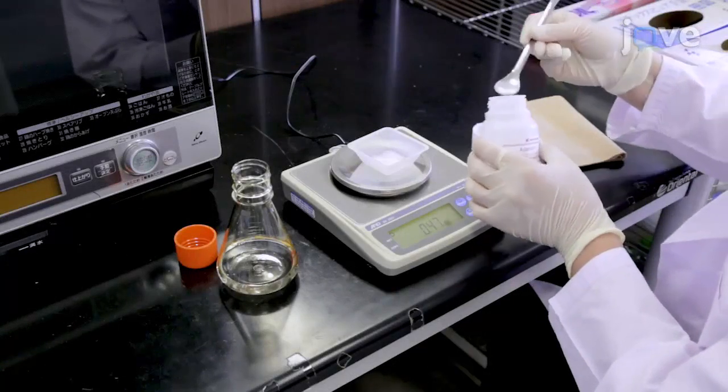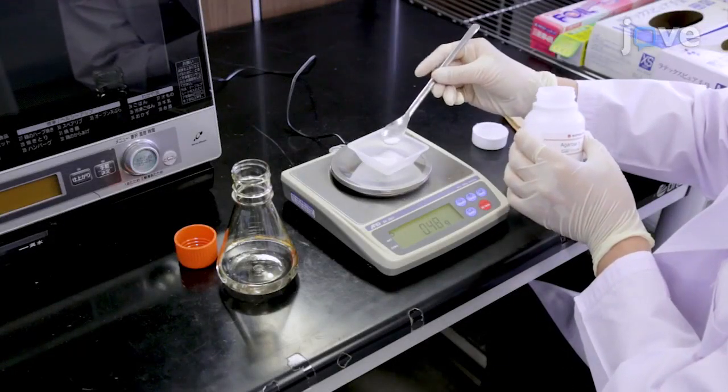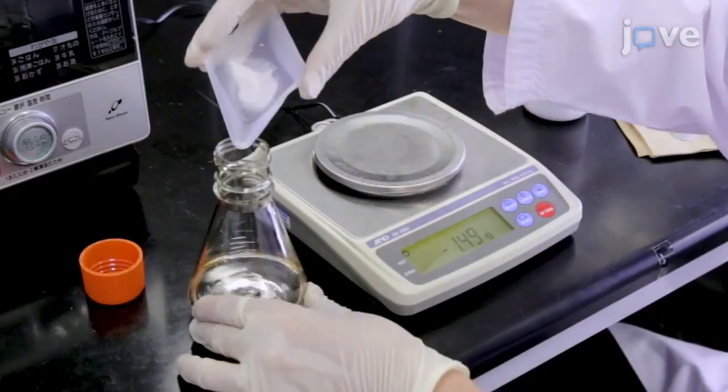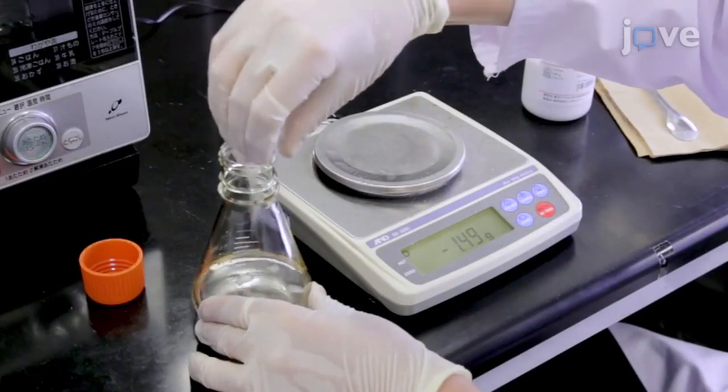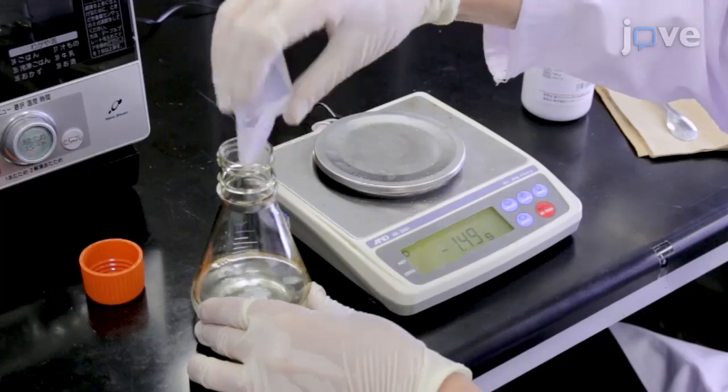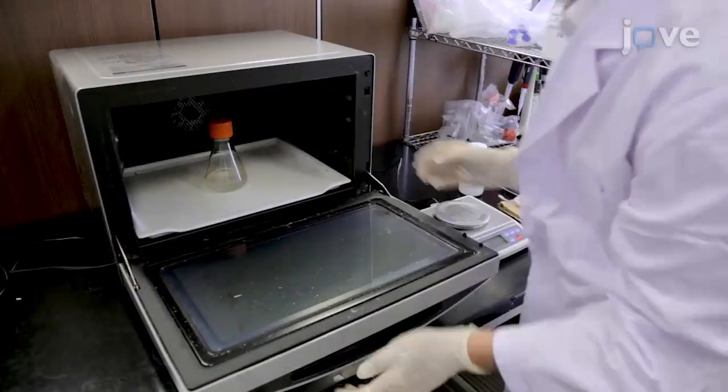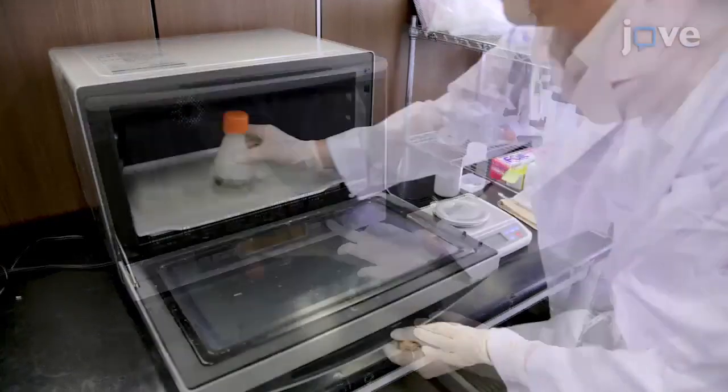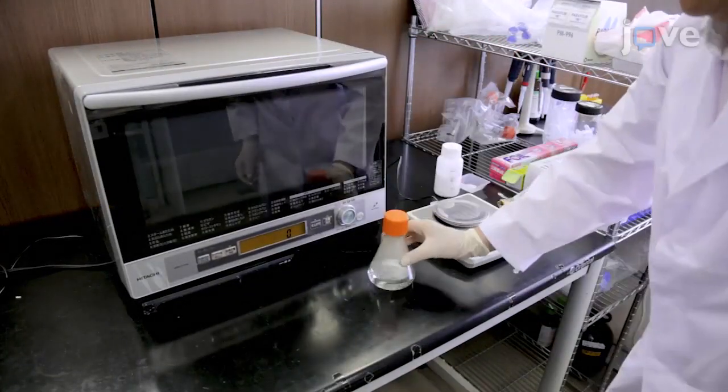To begin, prepare 0.5% agarose by dissolving 500 mg of agarose in 100 ml of distilled water in a 250 ml conical flask. Place the flask in a microwave at the power of 800 watts to heat about 1 to 3 minutes. Cool the flask at room temperature.